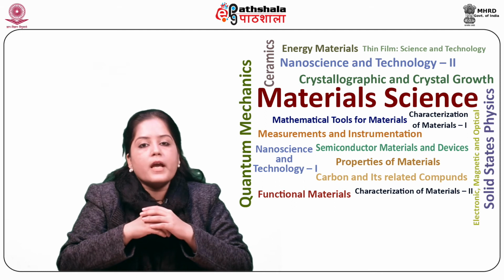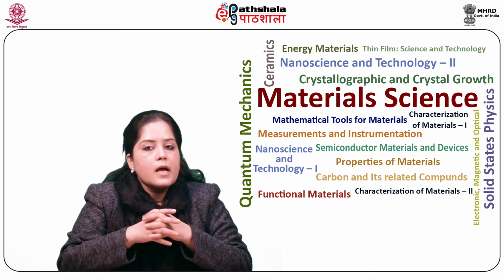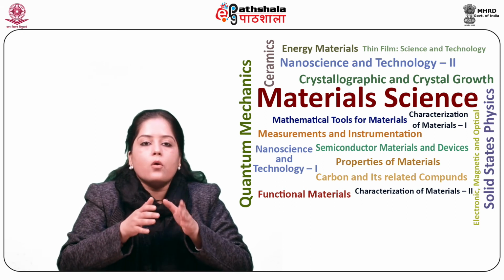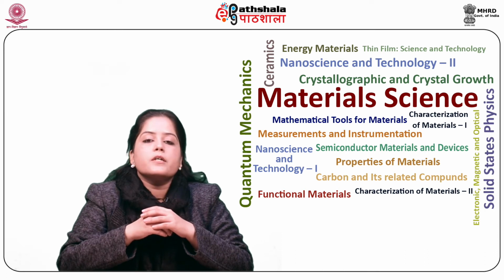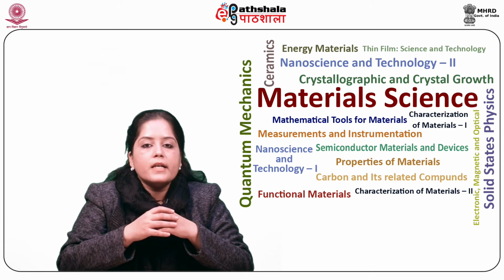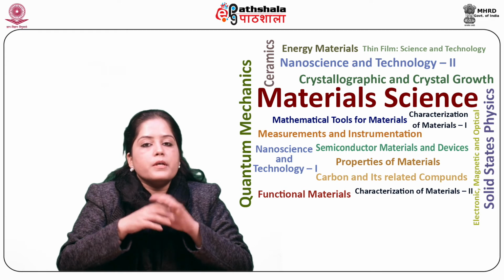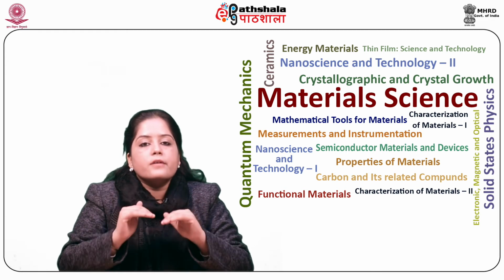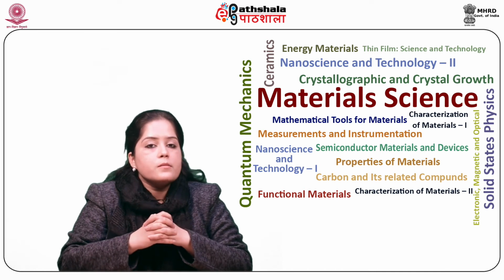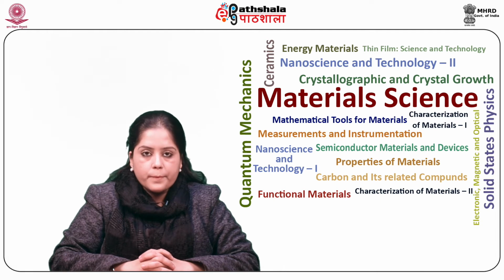So static mode can be useful as a simple imaging mode, especially for robust samples in air that can handle the high loads and torsional forces exerted by static mode, but also surprisingly for more delicate samples in liquid, as long as the force can be controlled below 100 piconewton. Let us now discuss piezo response force microscopy.